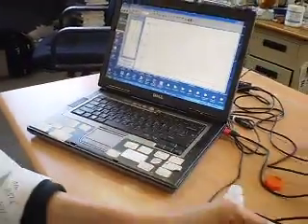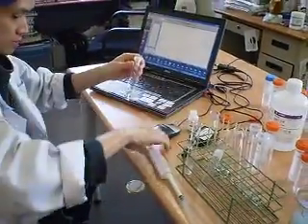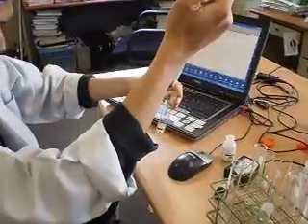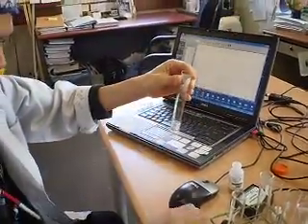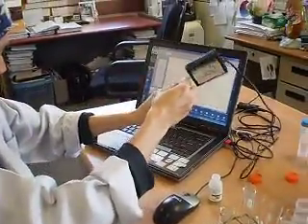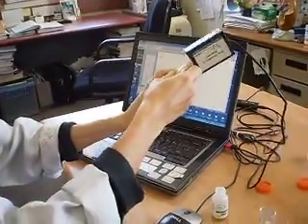I get ready now. I'm going to add my enzyme catalase and measure the pressure increase. This is the reaction.